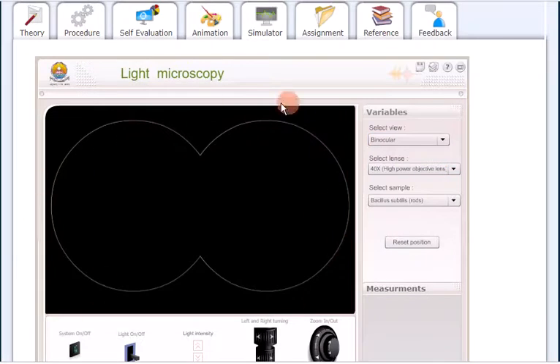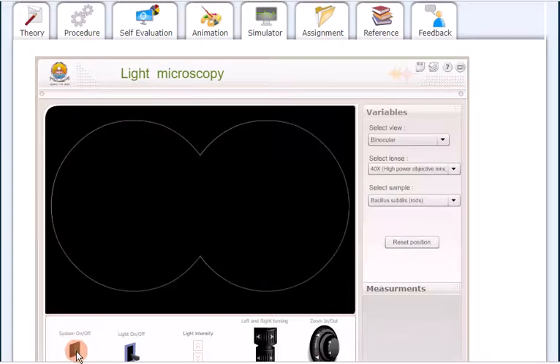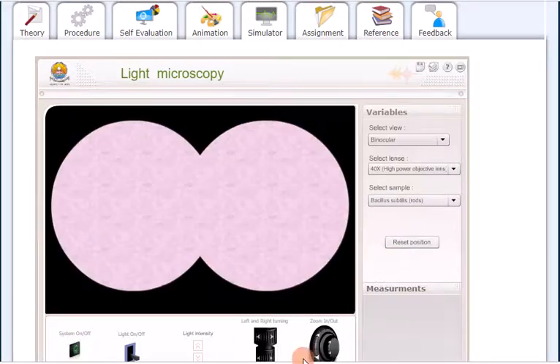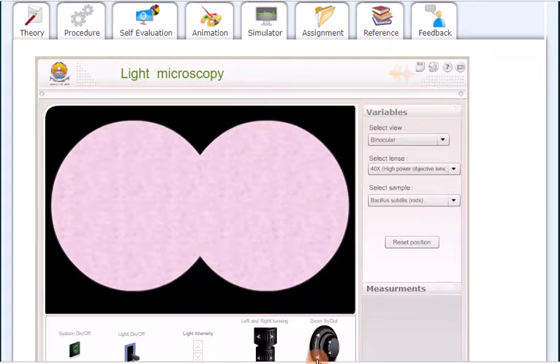And you can also change this. This is called binoculars, where binocular can be used. So when you use the binocular, you are using a light. So you need to move your slides. Okay, you are moving up, down, then also moving in this direction. Just look at this way I am doing it. You can take it off, make it clear. Okay, better.